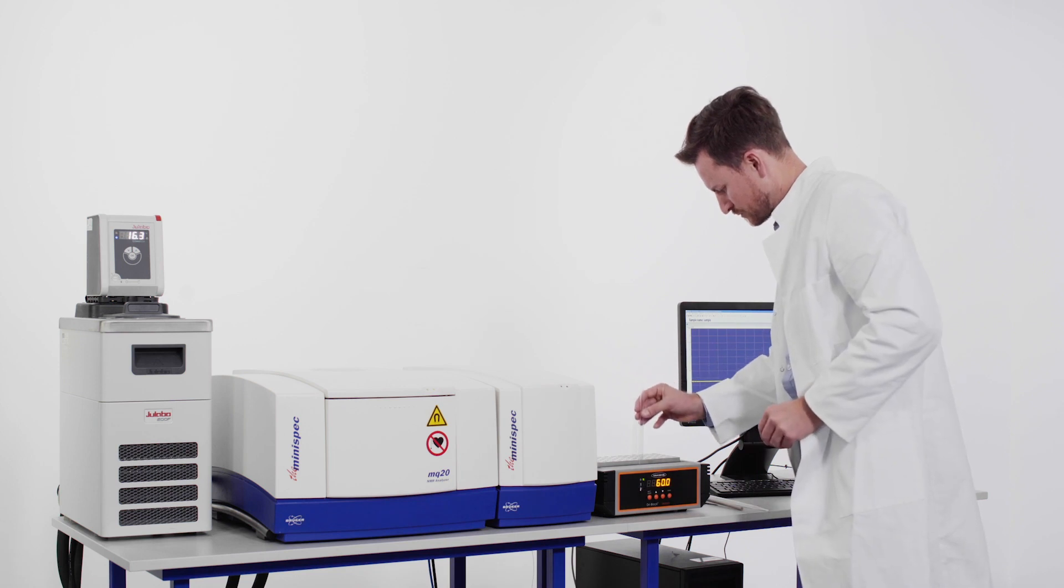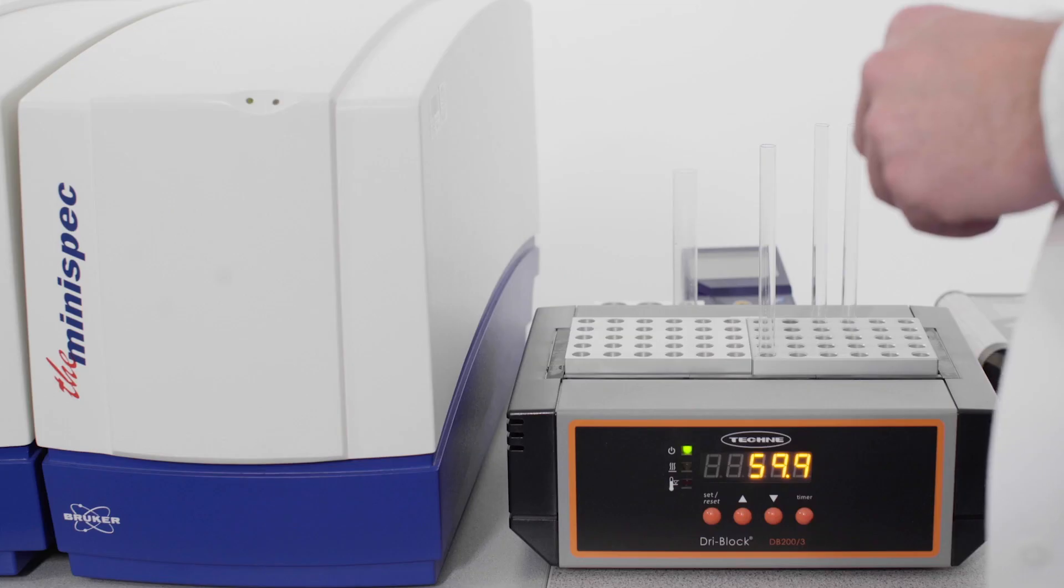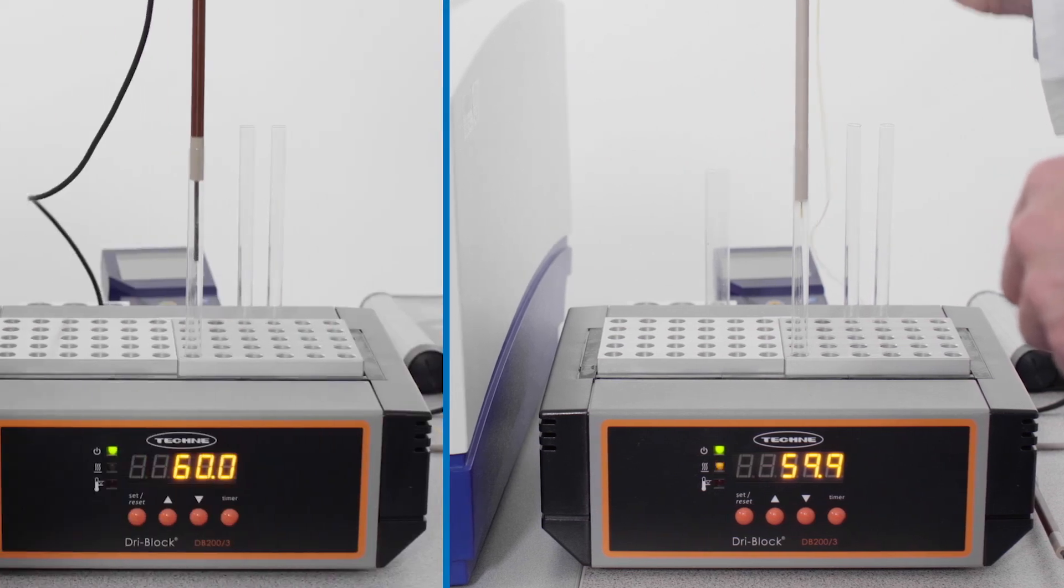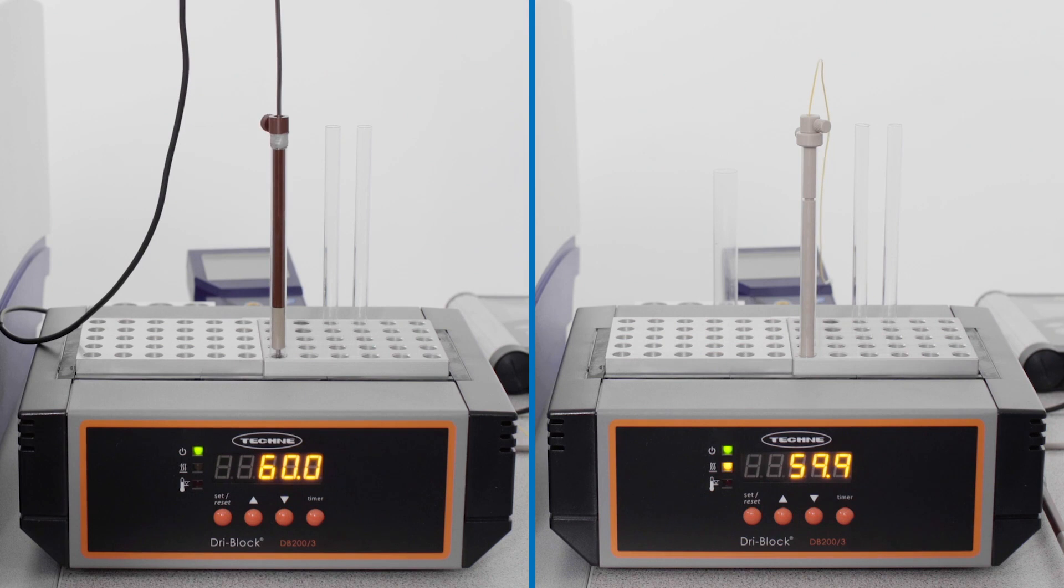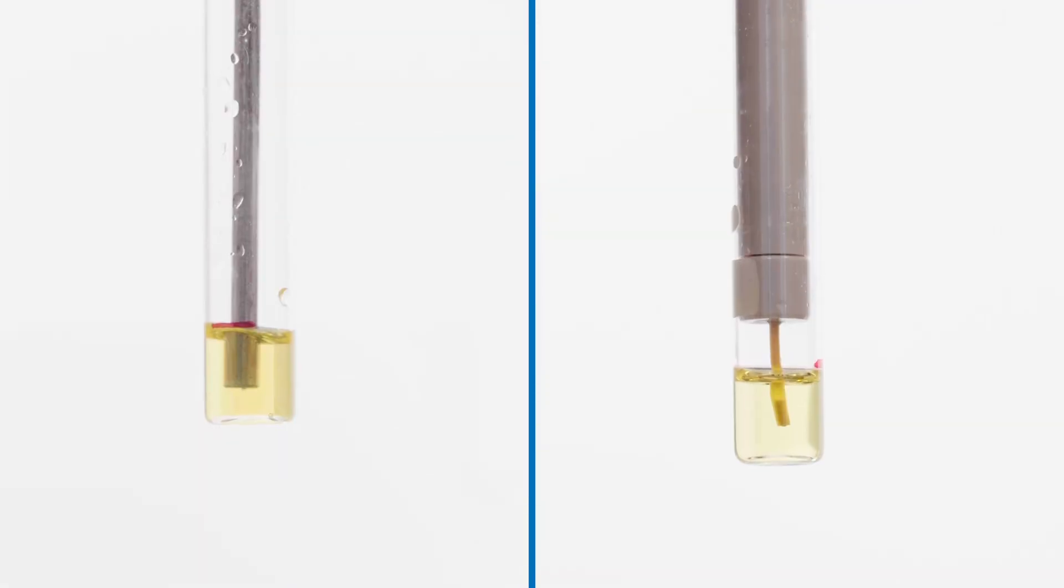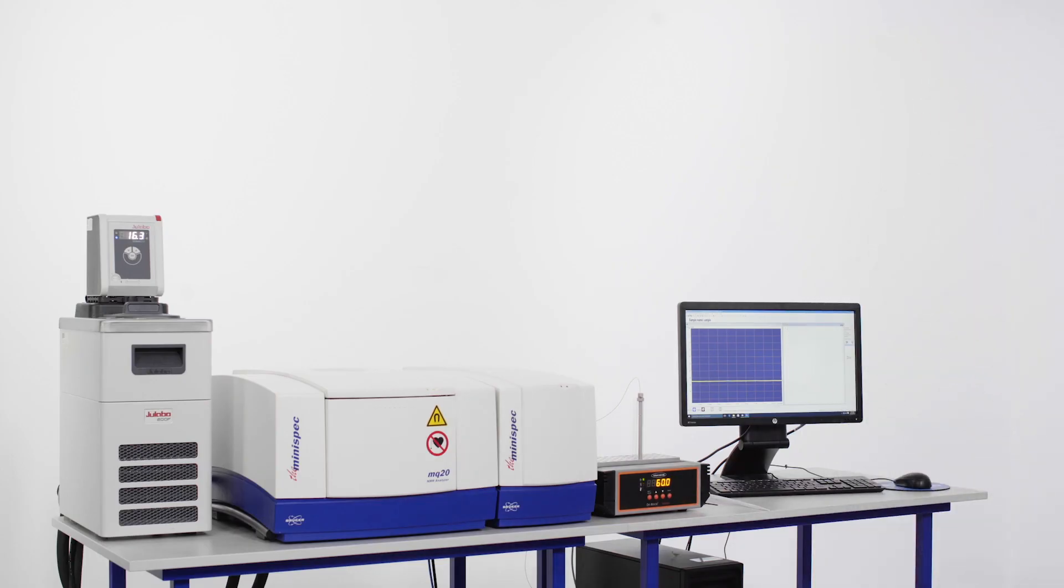The sample is simply filled in a standard 10 mm NMR glass tube that is later inserted in the TDNMR device after pre-tempering. The measurements require no sample preparation and are reagents free, making the method truly non-invasive and compliant for the food sector.